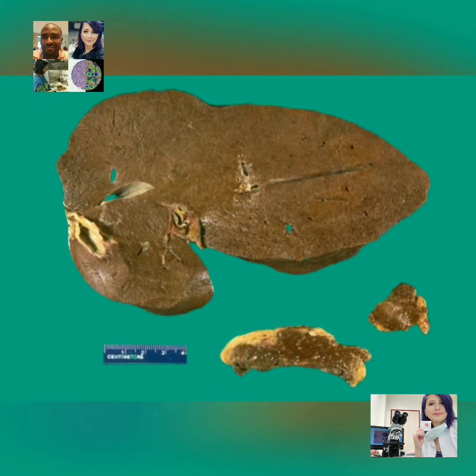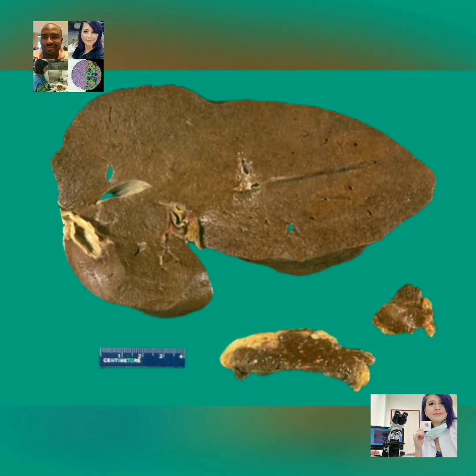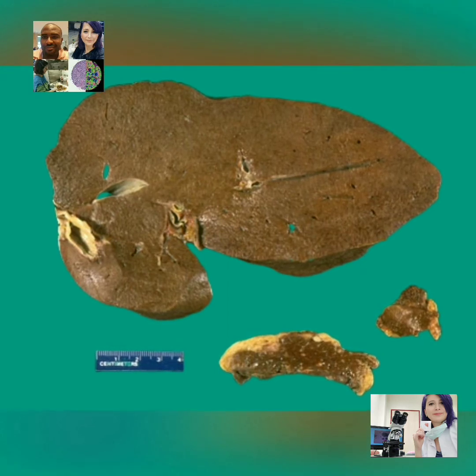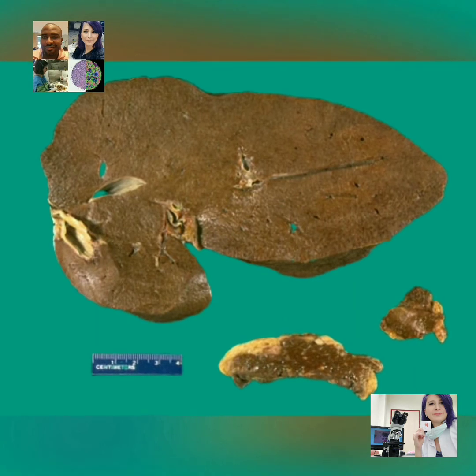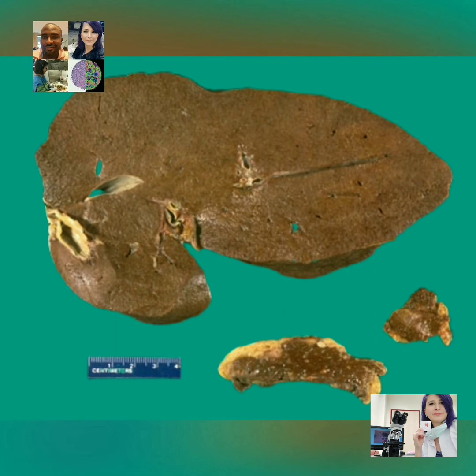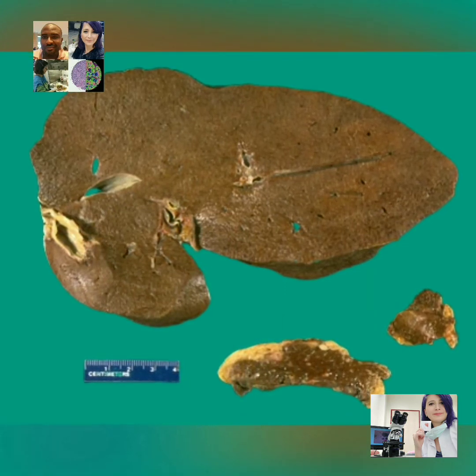Samples are taken from the tumor, from the parenchyma, from the resection margins, and from lymph nodes where available or where possible. Each of these cassettes should be recorded appropriately and given specific codes. The codes designate the area the biopsy is taken from. The codes could be in alphabets or it could be in figures.